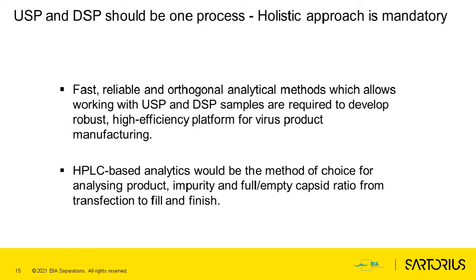can be orthogonal to other methods like PCR to give us much better insight in the quality of our upstream, in the improvement of our upstream, in the robustness of our upstream, and also in the improvement of the expression of our product.